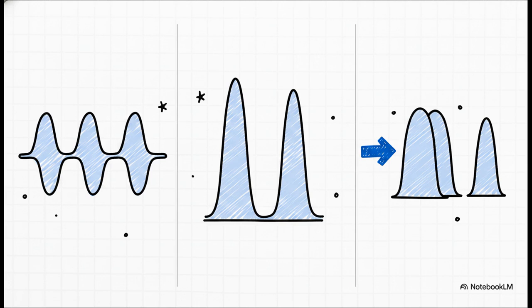Deuterium? It has a spin of 1, instantly revealing itself as 1:1:1 equal triplets with about a 45 Hz one-bond gap. Fluorine-19, spin of 1/2, strictly follows n+1 rules but gives itself away with those giant, massive one-bond couplings, up to 370 Hz. And finally, phosphorus-31, also spin 1/2, perfectly demonstrates distance decay, dropping from large one-bond gaps all the way down to tiny two-bond gaps of around 6 Hz.